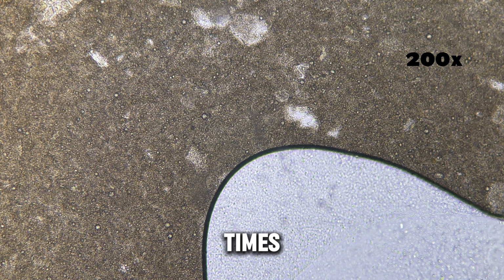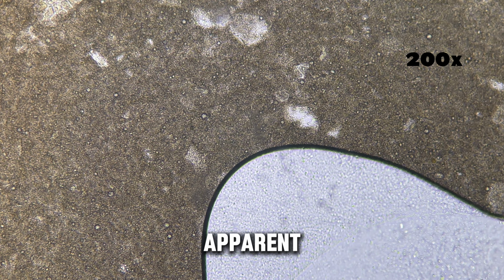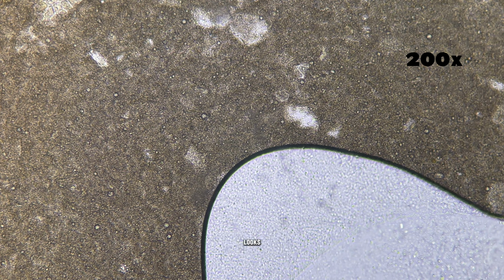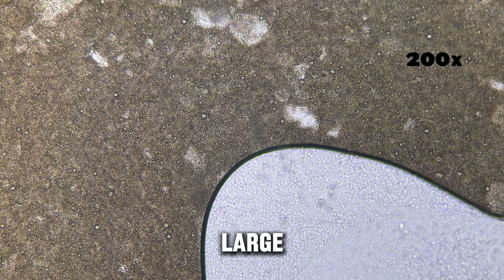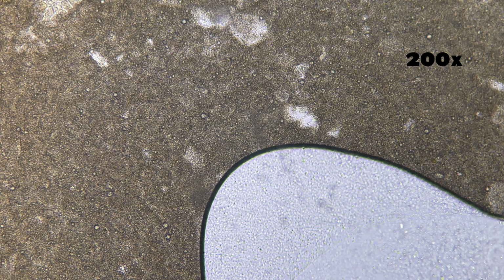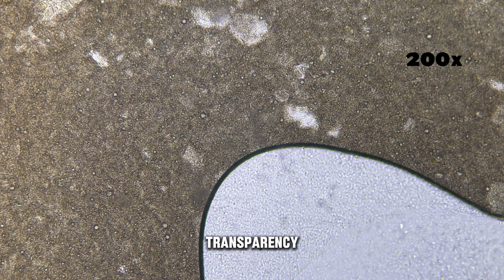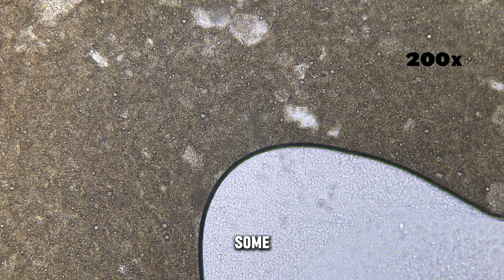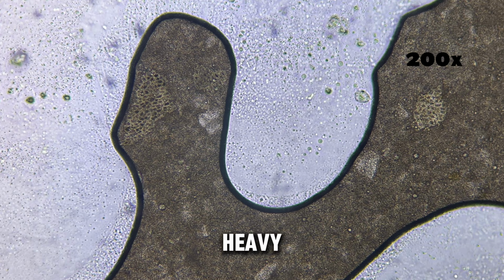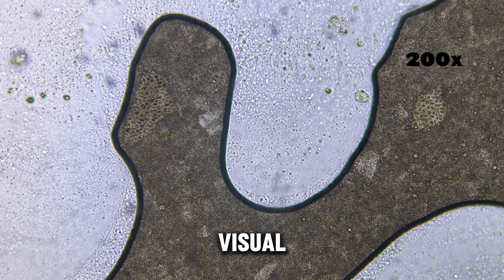At 200 times magnification, the internal organization of mustard becomes more apparent. The sample no longer looks continuous. Large fragments now reveal clear boundaries and internal texture. Different regions show noticeable differences in density and transparency. Some areas appear tightly packed and heavy. Others look softer and more fluid. This contrast creates a layered visual effect across the slide.